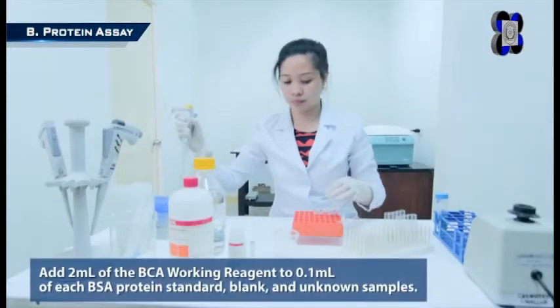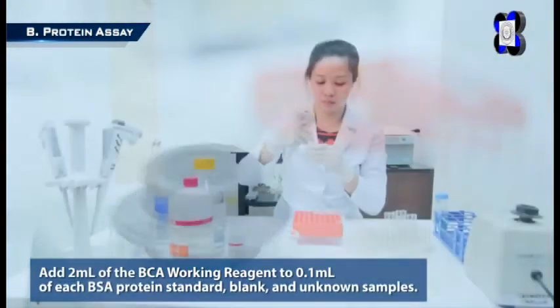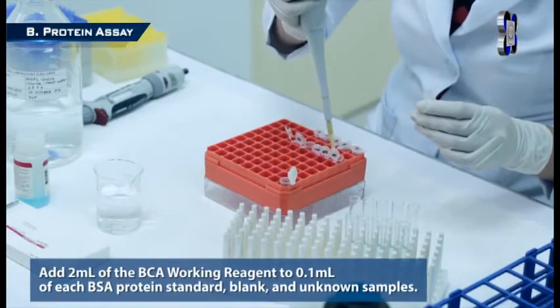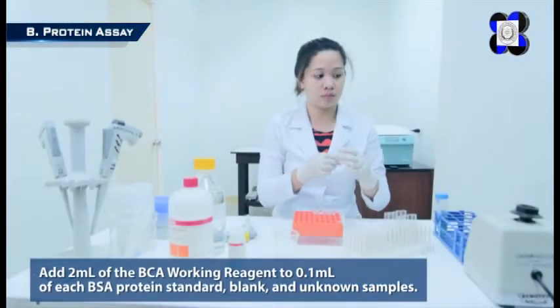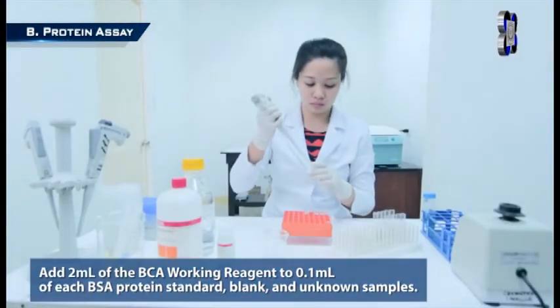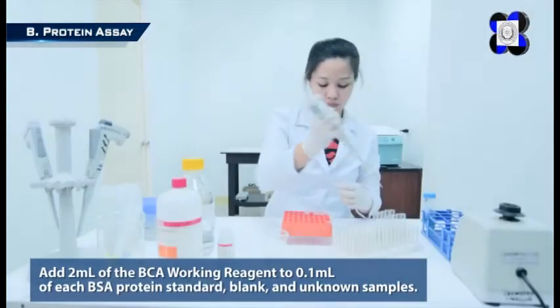Step 4: Add 2 milliliters of the BCA working reagent to 0.1 ml of each BSA protein standard, blank, and unknown sample. Seal test tubes with caps and vortex gently for thorough mixing. The total liquid volume in the test tube is 2.1 milliliters.